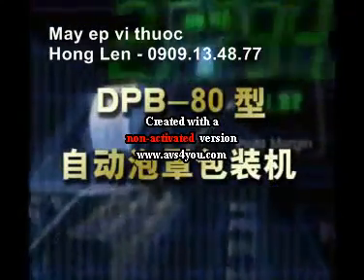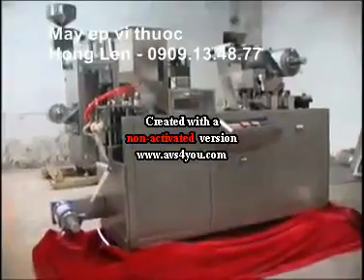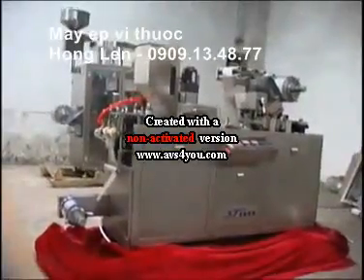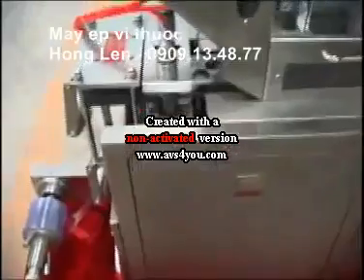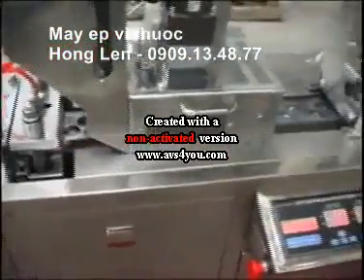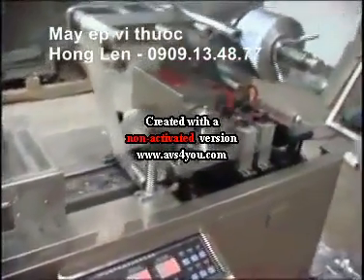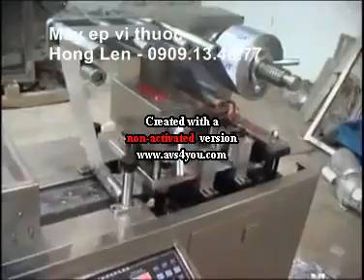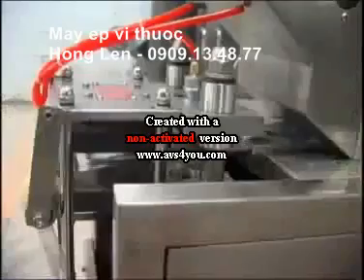DPP-80 Model Flat Plate Auto Blister Packing Machine, which absorbs the advantages of aluminum plastic packing machines both at home and abroad, is designed by our technicians according to the requirements of the pharmaceutical packing technology. It has been improved to achieve the world level and to apply instead of the same machine.